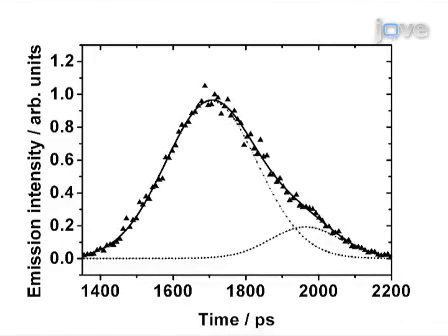By plotting the lifetimes extracted from each pixel of the FLIM image, a histogram of fluorescence lifetimes can be obtained across the whole image, allowing for mapping the microviscosity in distinct cellular regions of living cells.